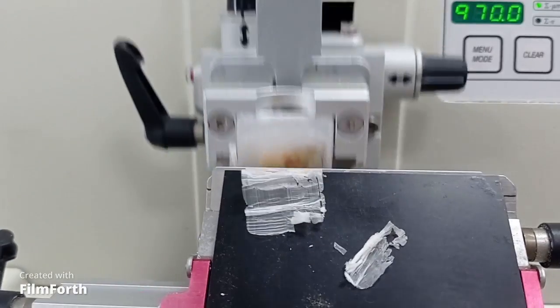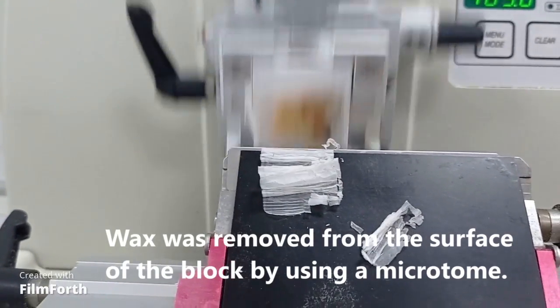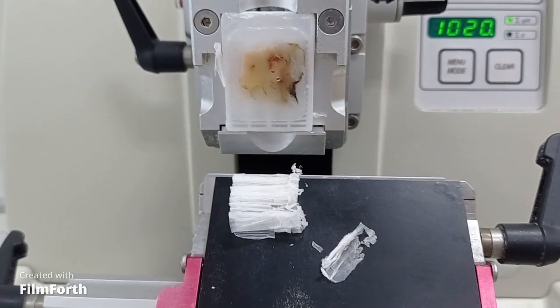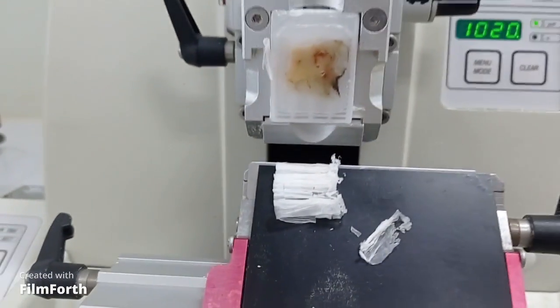At this point, after cooling the blocks, I am taking the blocks one by one and putting them on the microtome machine and trimming them first to expose the complete tissue. After that, I will proceed to the microsectioning.